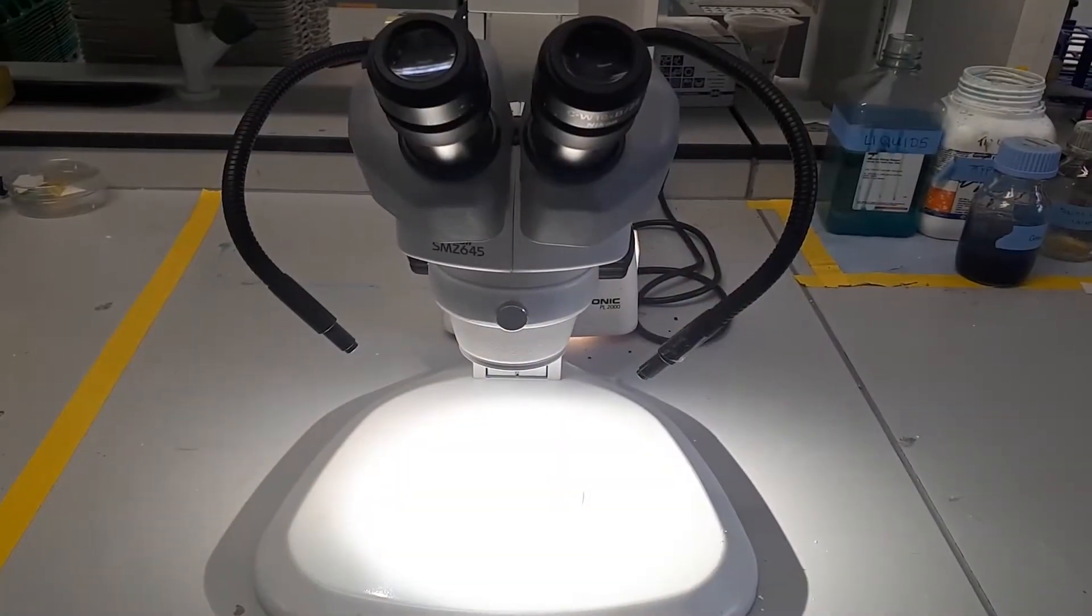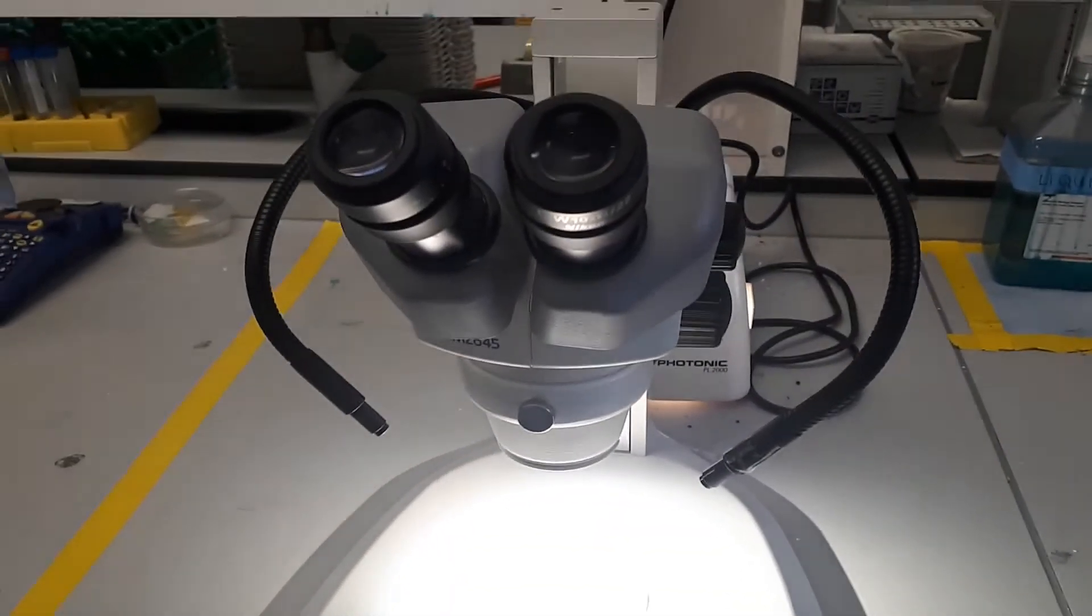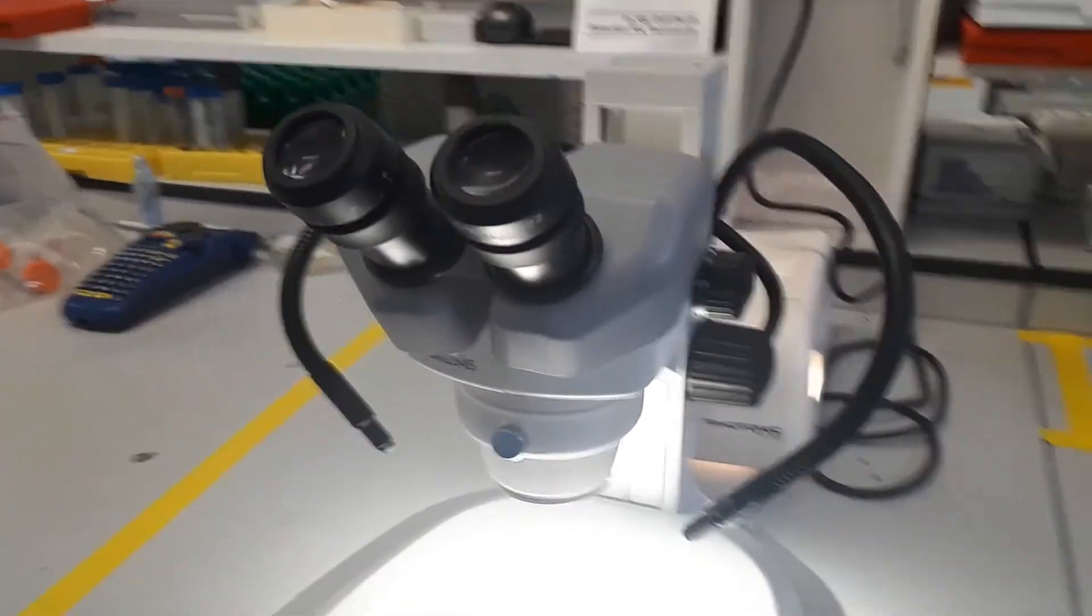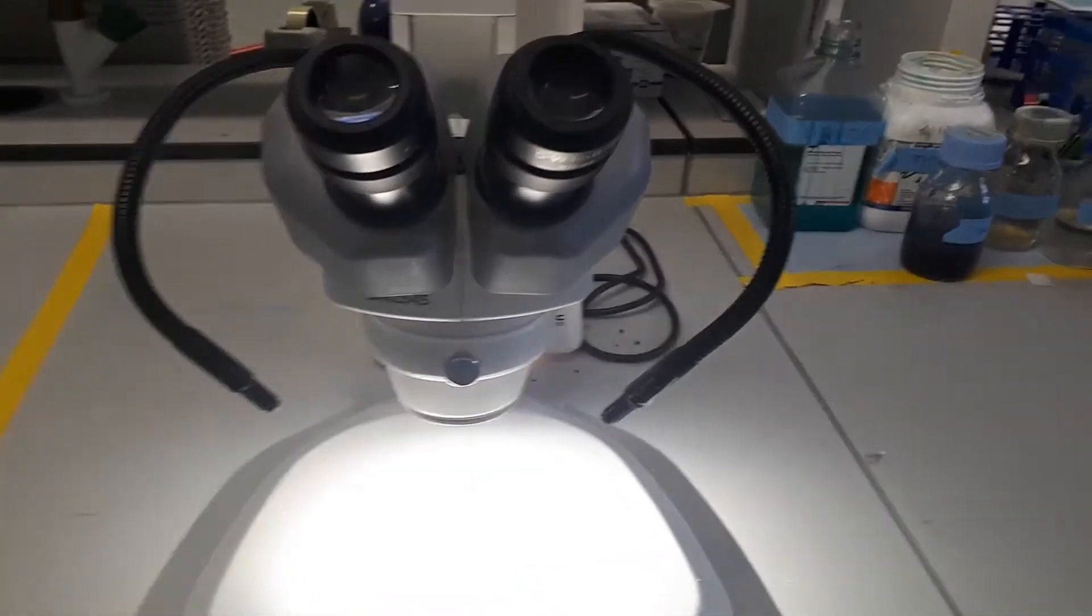Have you heard of a microscope before? Do you know what it does? Let's have a look at one. So we use microscopes to zoom in on things which are really, really small. If we look down this part, which is called an eyepiece, we can zoom in really close.